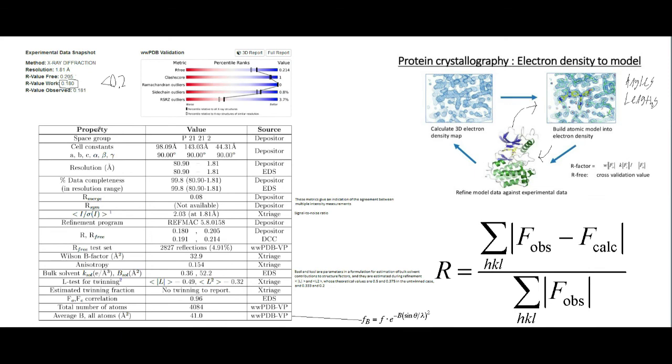And once again, this is from the X-ray crystal structure I got of a protein called OXA-239. It's a clinical variant of an enzyme that bacteria use to break down antibiotics, conferring antibiotic resistance on those bacteria. We see we got our specific space group here, which we determined from the data. We got our cell constants.